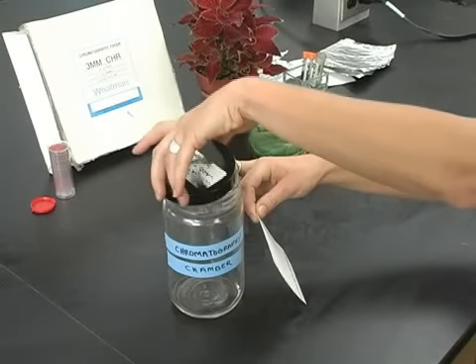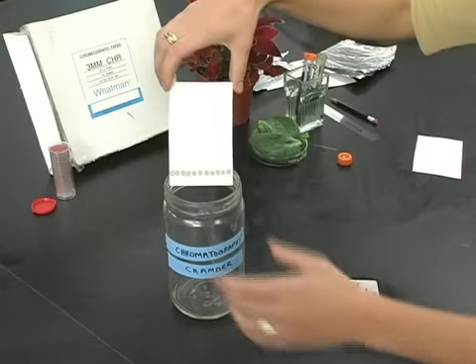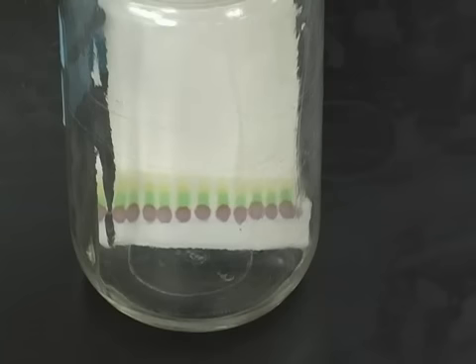When this is complete and your pigments have dried, carefully place the paper inside the chamber, making sure that your solvent depth in the chamber is below the pencil line. If it is too deep, remove some with a pipette until it is a suitable level. Replace the lid on the chamber and allow the solvent to move up the paper until it's within a few millimeters of the top. This will take about 10 to 15 minutes.